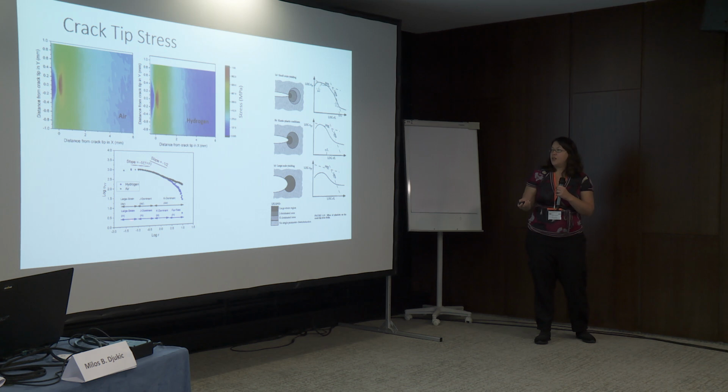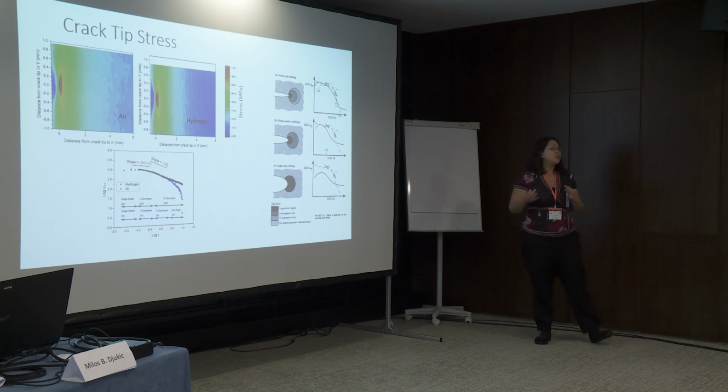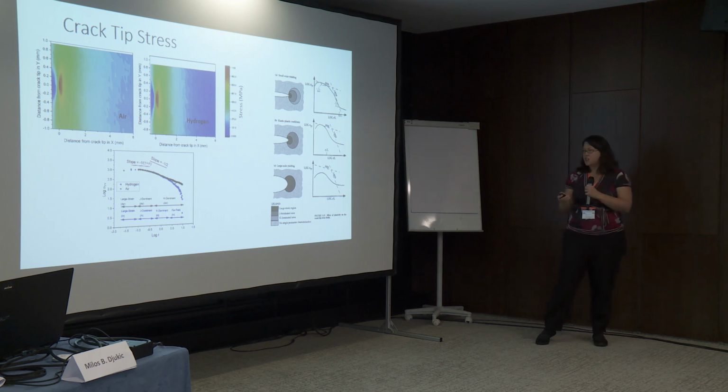We've got a large strain field right at the crack tip, which you'd expect. The J-dominant plastic region, again, you expect that. And then with the slope of -1/2, that's what you'd expect with the linear elastic region, the K-dominant region that allows us to do linear elastic fracture mechanics.